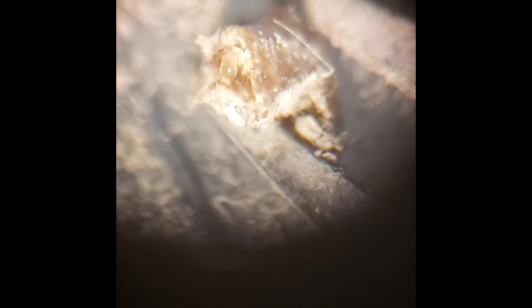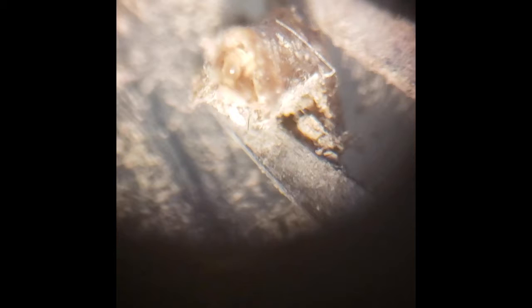The question of whether this is a mammal bone, an avian bone, or a reptile bone is good to ask. This is about a millimeter wide right here. The holes and the consistency of the core of this humerus-like bone suggest, A, it's a very small animal, and B, maybe a bird. It's also not very dense. It's not dense like a reptile bone would be. I think it's a bird.